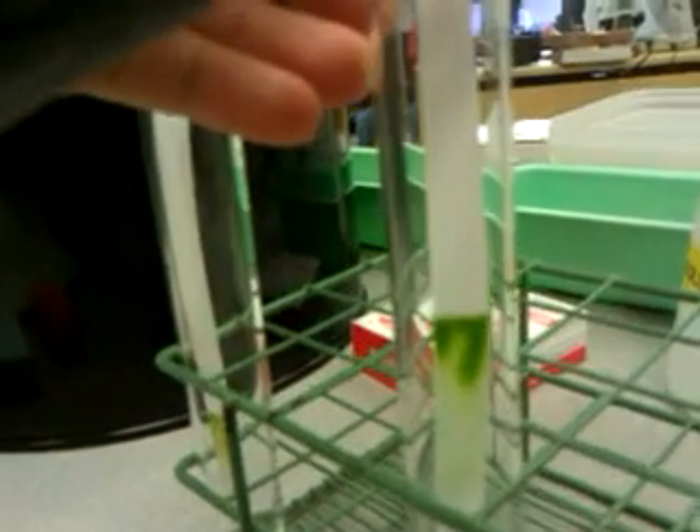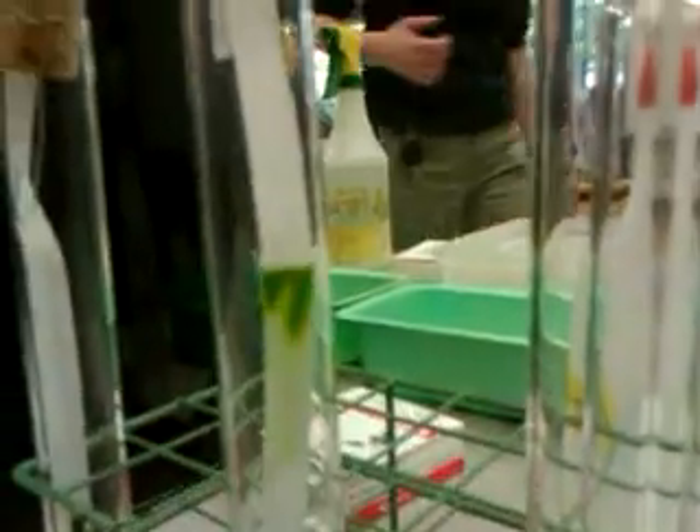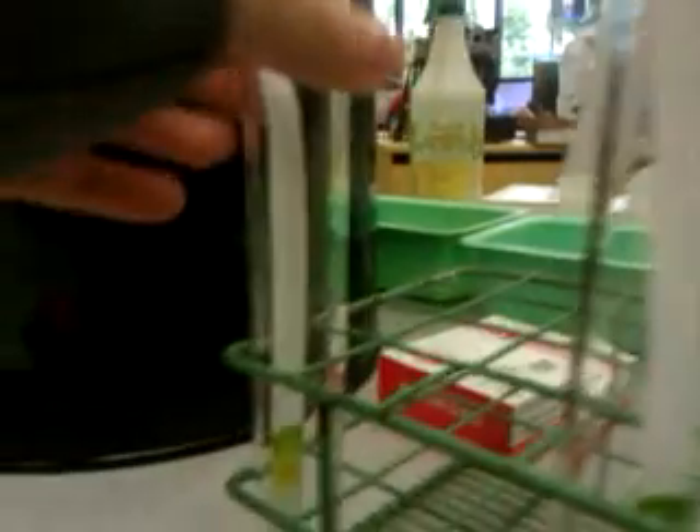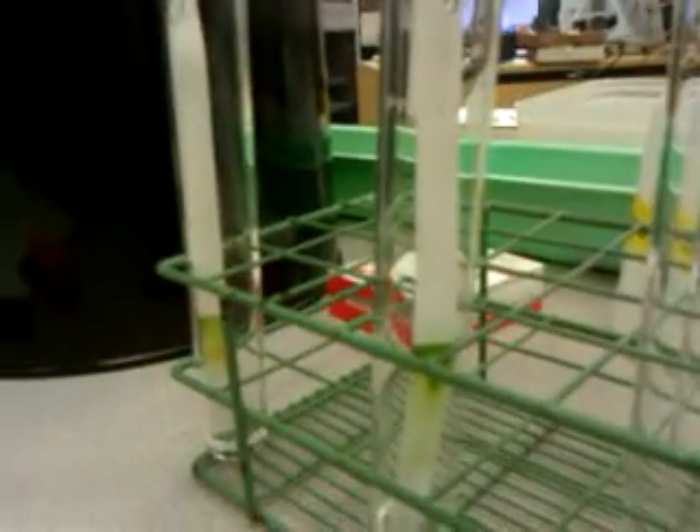So that's how it is done — separation of molecules. Sometimes the molecules have a color; sometimes the colors do not show until you spray it with a coloring reagent. This is the green algae one, and the brown algae one — and I did not label it. That's bad. Thank you.